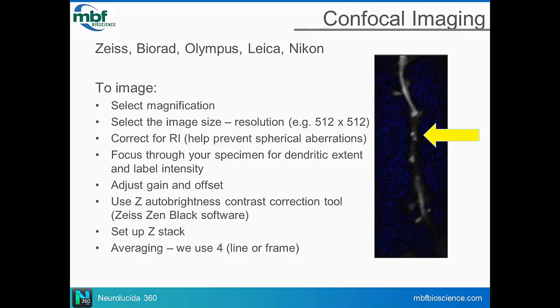It's important that you have the information you need. It doesn't have to be the cleanest or most stunning image. You can go back and collect that image in addition, but that's not the one you necessarily want to quantify from. Right, exactly. And you need a little bit of noise for deconvolution software in order for that to work properly as well.